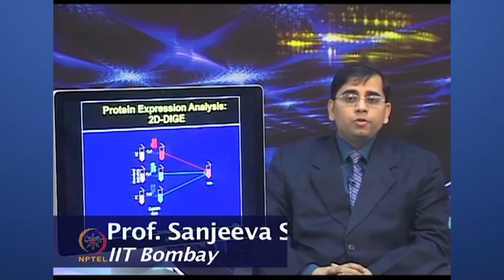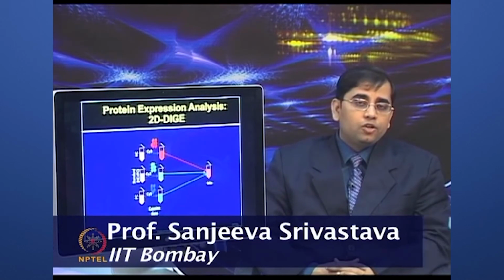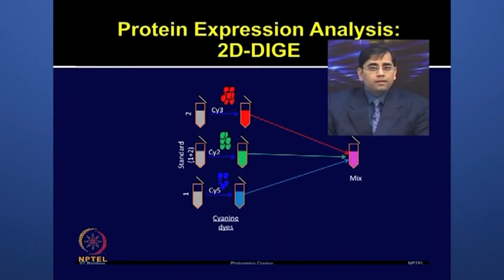The differential proteomic analysis was performed in two different cohorts of histologically confirmed prostate cancer with different grades of the disease. They used patients with two different grades based on the Gleason grading system, which is used to help evaluate the prognosis of men with prostate cancer.